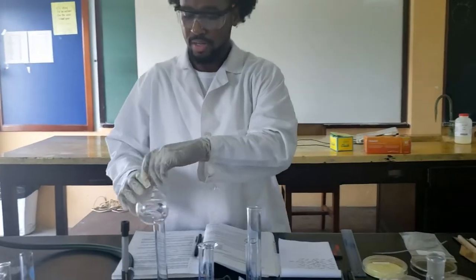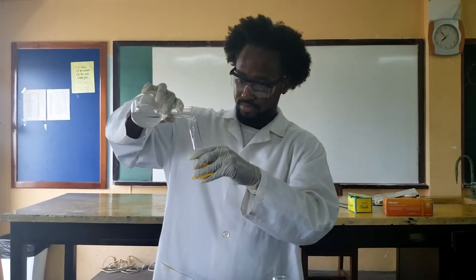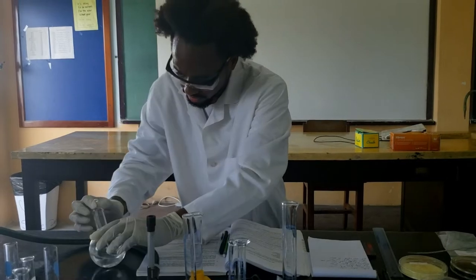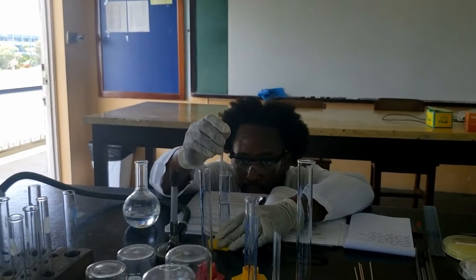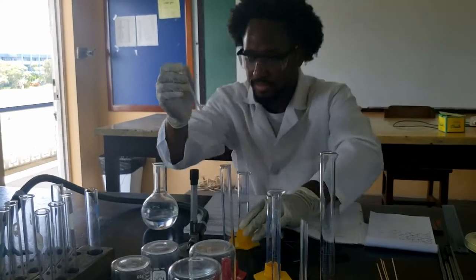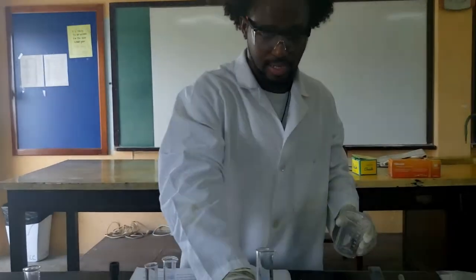So we have vinegar here, and we require 20 ml of vinegar. Of course, we do all readings at eye level when measuring — that way we get exact values. So we have our 20 ml of vinegar; put that inside a beaker.